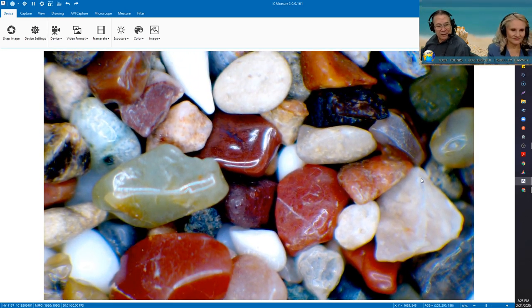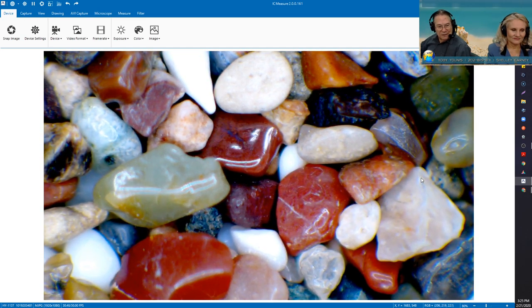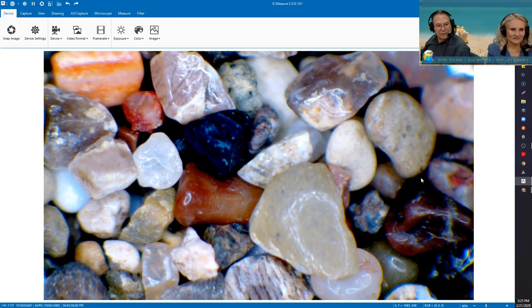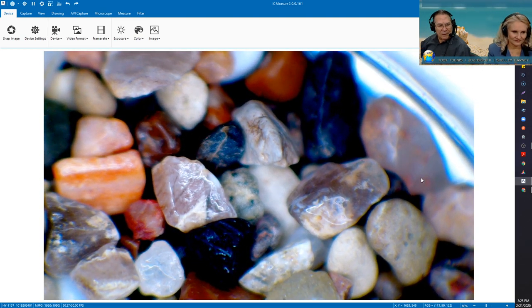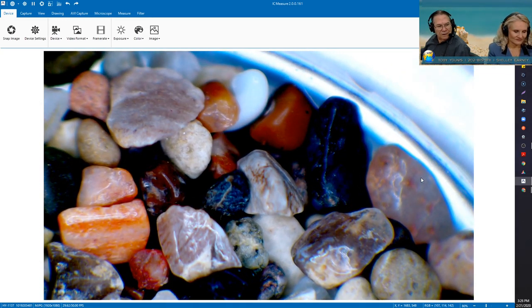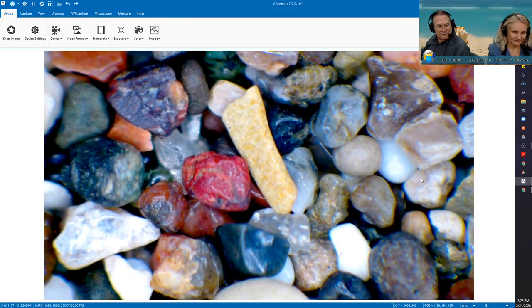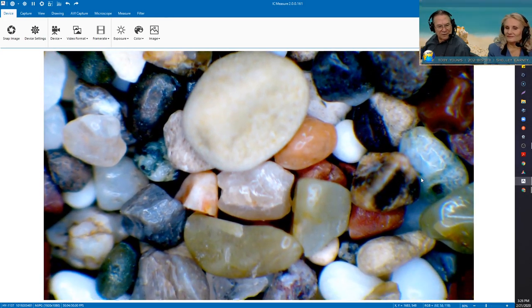When I put it under the polarizing microscope, I literally got nothing in response to it. But there are shell fragments. There may be some forams in there. I'd have to take a look at them under the higher magnification of the polarizing microscope to be able to truly tell. So I don't know if anybody out there is a geologist and has any sense of what the dominant stuff is in here, geologically speaking. They can share that with us.